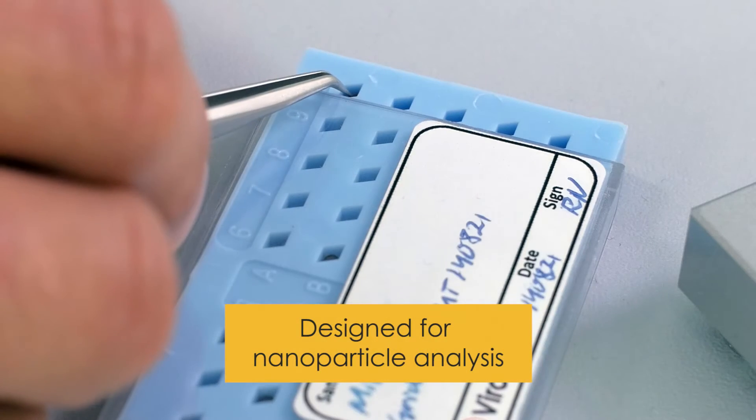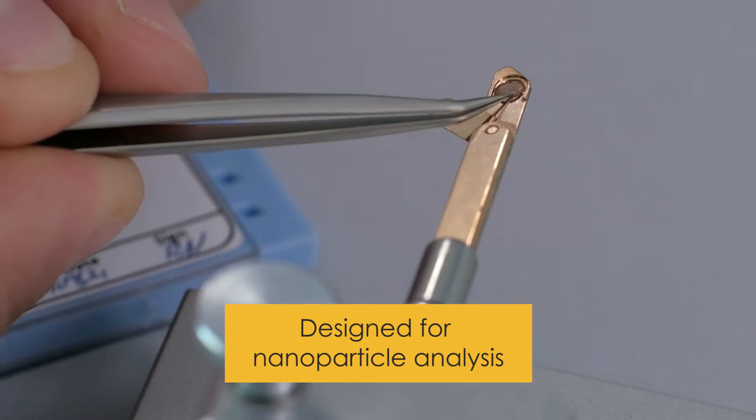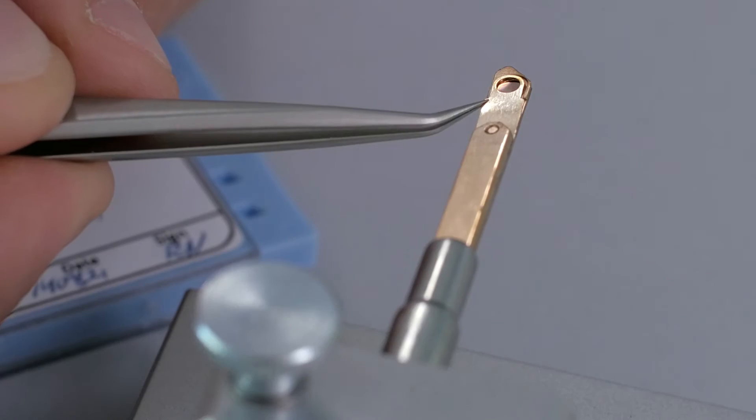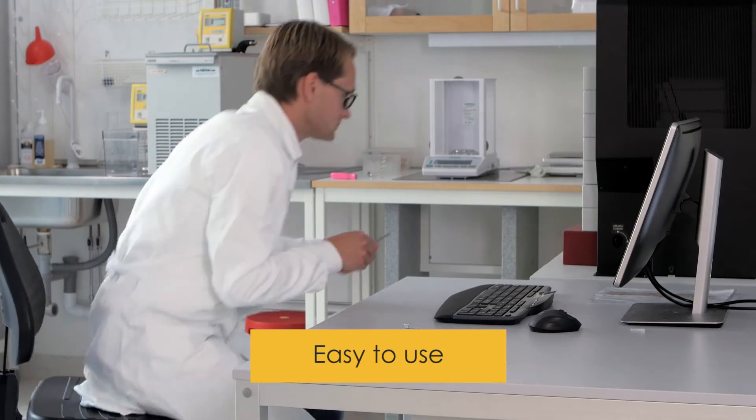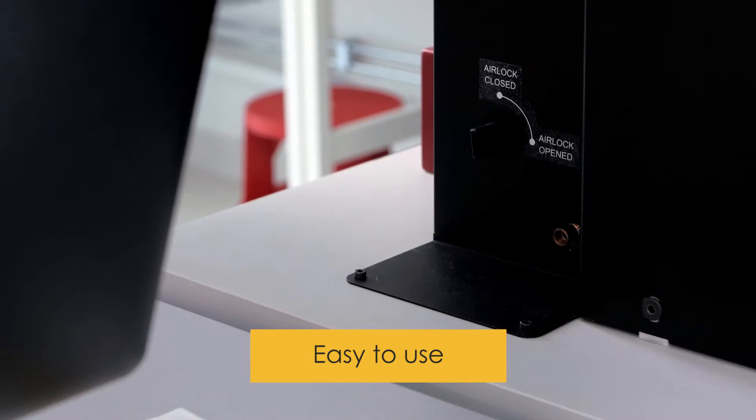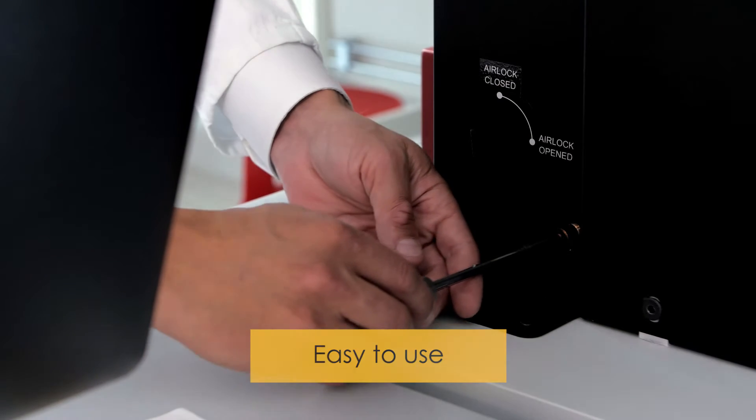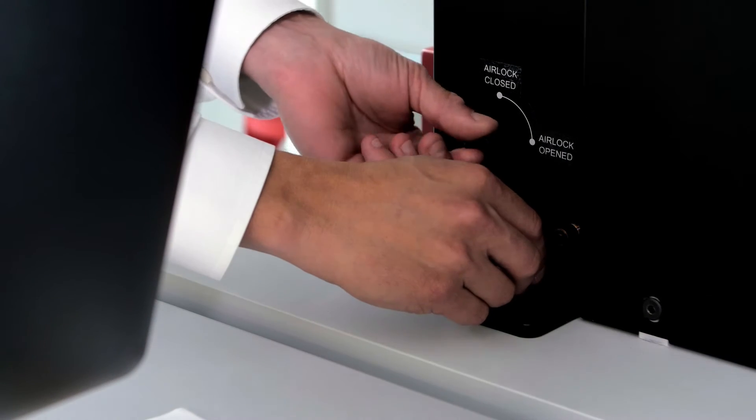Minitem Transmission Electron Microscope is specifically designed to characterize nanoparticles. As a compact, low-voltage system, it runs in any laboratory setting. All you need is a standard wall socket.